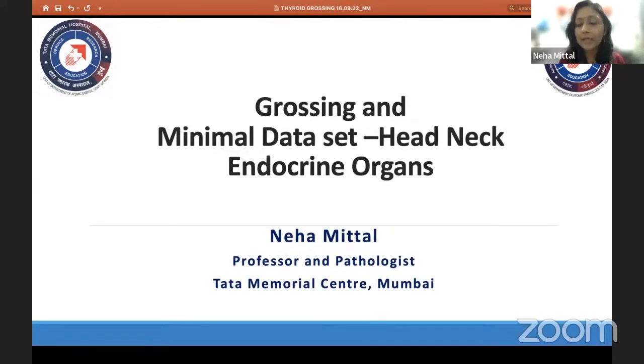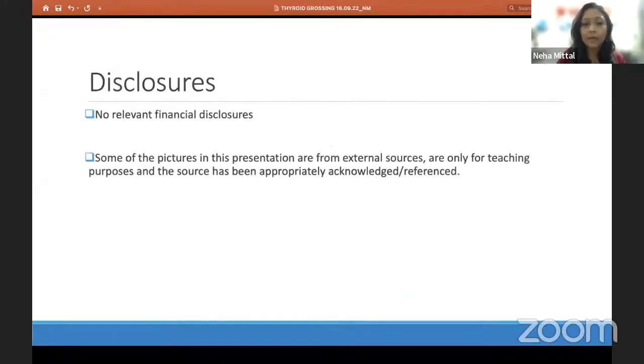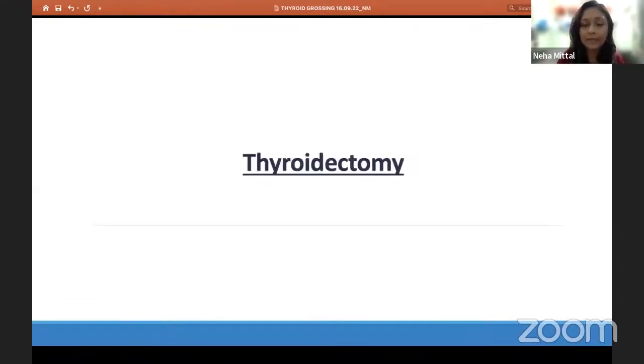And my talk today is made much easier by Dr. Khan and Dr. Gosain, by their wonderful talks and by apprising you all of the changes that have happened in the new WHO 5th edition 2022 in these endocrine organs of the head and neck region, namely thyroid and parathyroid. And I'll be restricting to the grossing of these organs only. So no financial disclosures, and some pictures in this presentation are from external sources, which have been appropriately referenced.